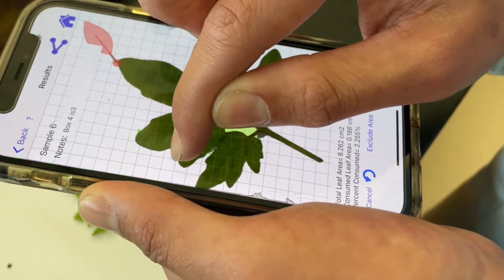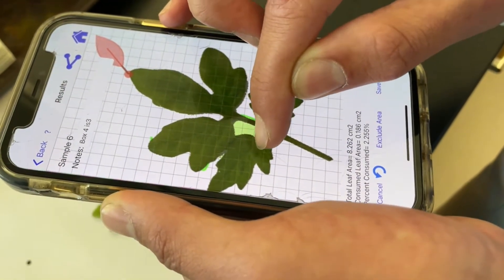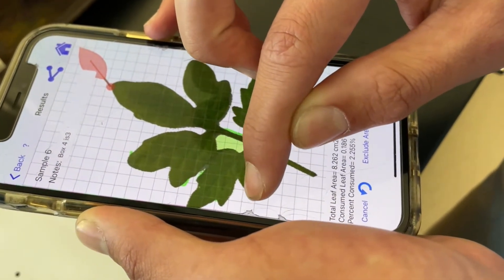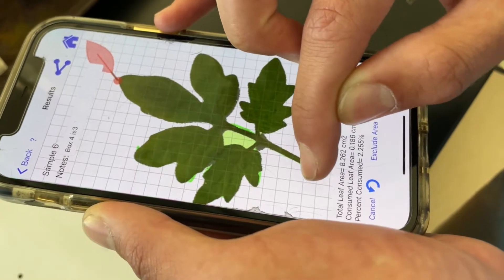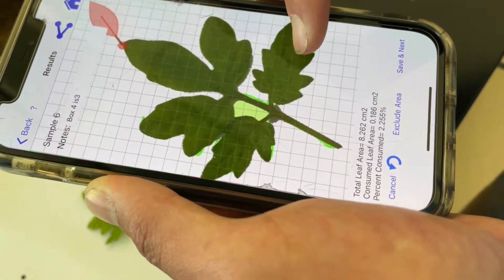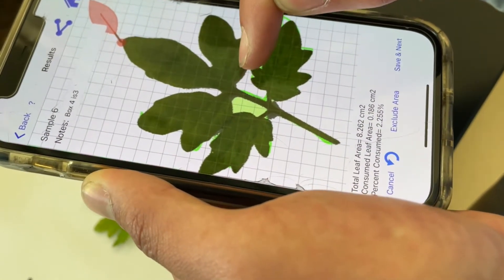You're just going to trace the leaf as best you can, getting the whole thing. It works a lot better on an iPad with an Apple Pen, but yeah, there is going to be variation depending on how well you trace it.